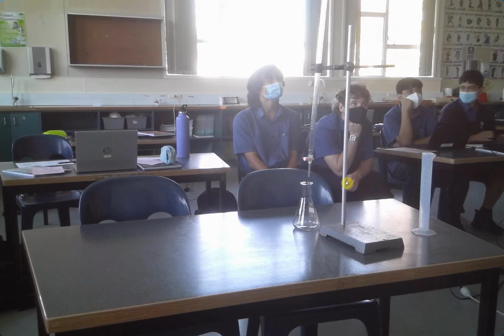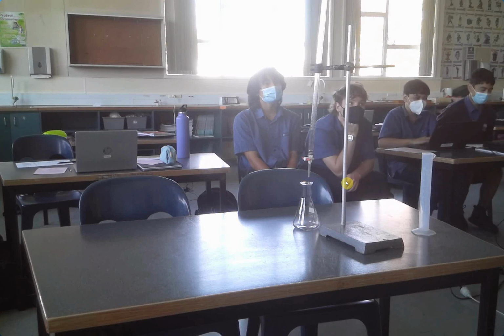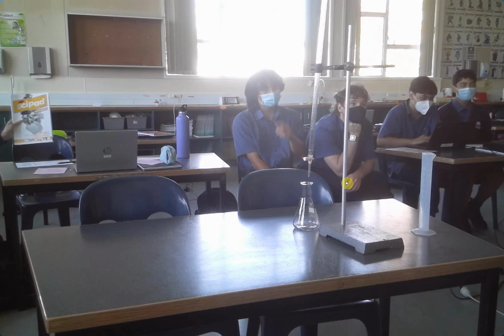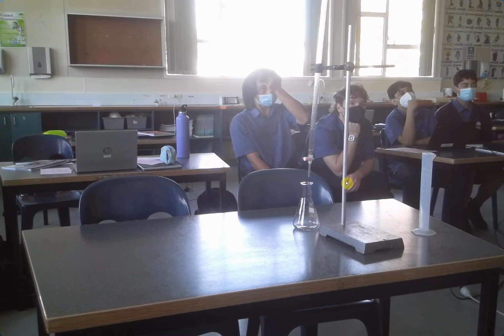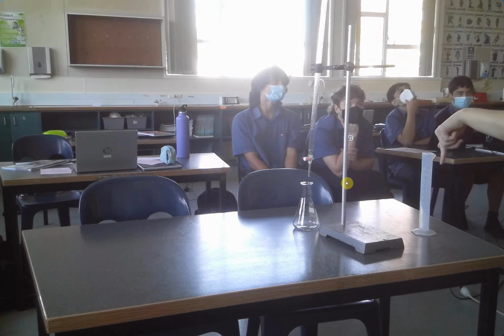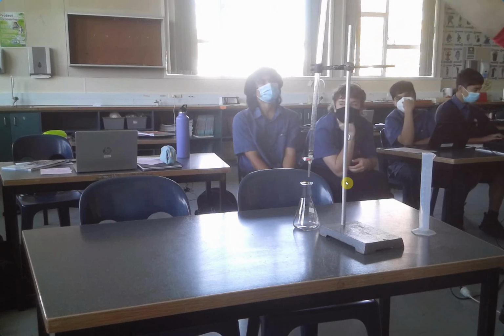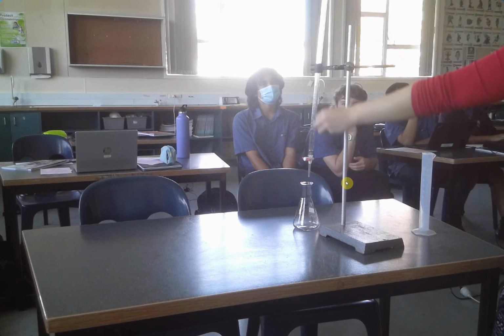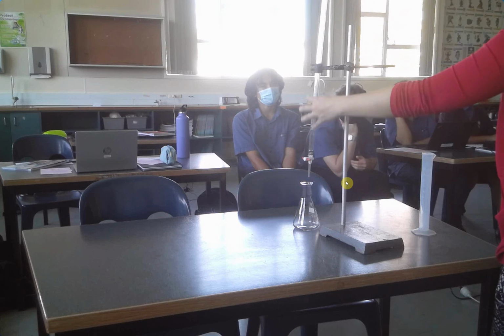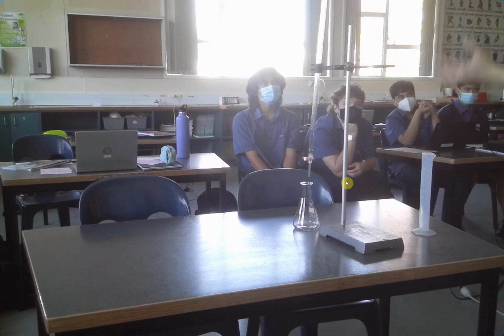Purified water. So what I've done in this is that this water is purified. It's removed all the ions from it, so you don't have that cross-contamination. Something to remember with this equipment is you're never using any of the tap water through it. Never. Only distilled water. The reason is that tap water has little ions, and if they stay in my equipment, they could crystallize and clog it. On top of that, it could also affect your readings.